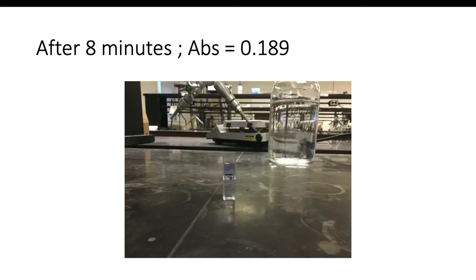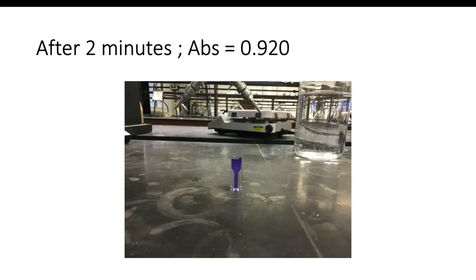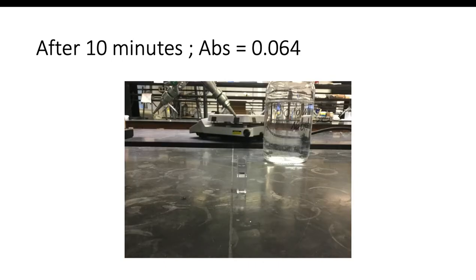So I'm going to quickly progress through all these one more time. If we start, there's our starting solution. And over time, we see that solution lighten in color. So after 10 minutes, it's basically clear in this case. We see our absorbance getting very close to zero now.